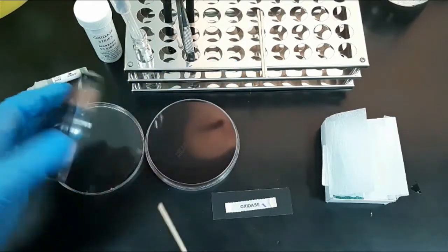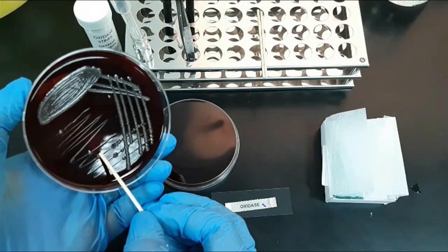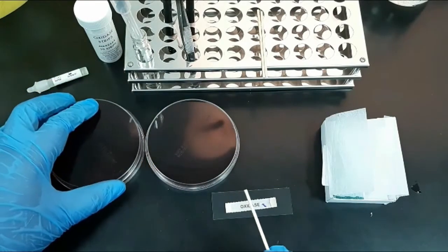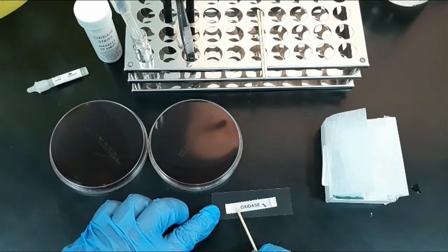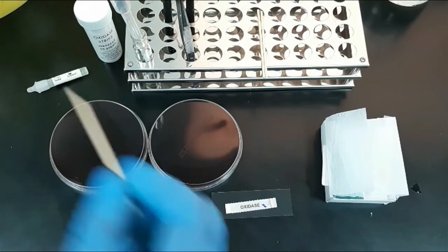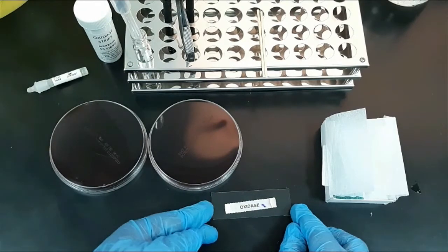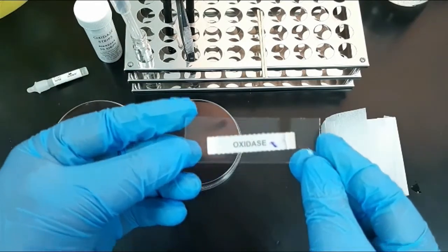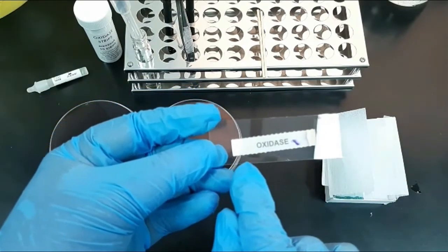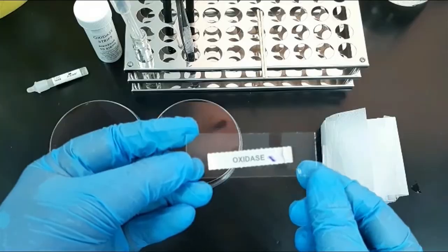Now repeat the procedure using an oxidase-negative control bacteria on the other side of the paper. Pick the organism from the culture media and rub it as before. You can notice there is no formation of purple color in the rubbed area. Now you can compare the positive and negative oxidase reactions.